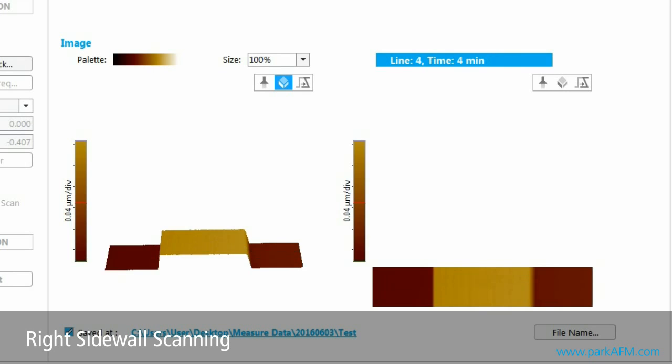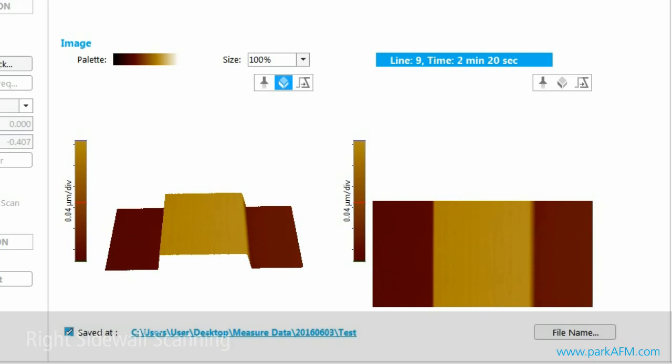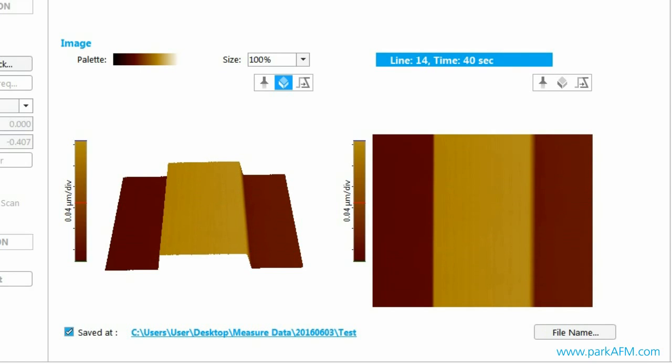The rotating head enables high precision investigation of sidewall shapes, a feat difficult for regular AFMs.